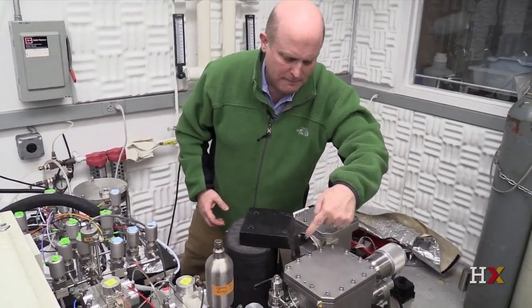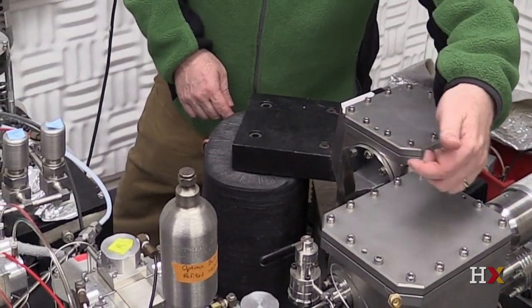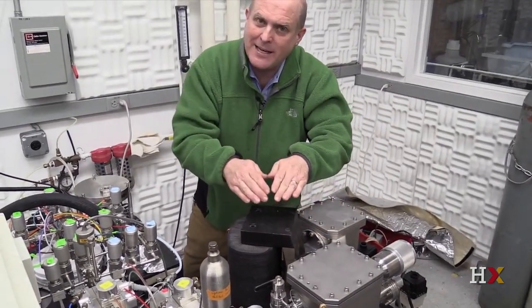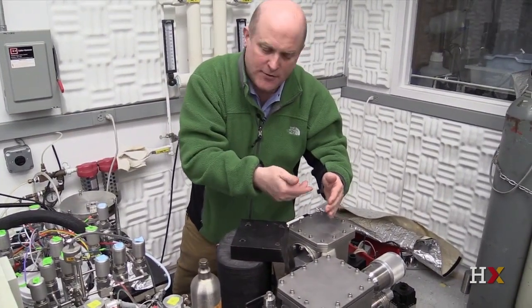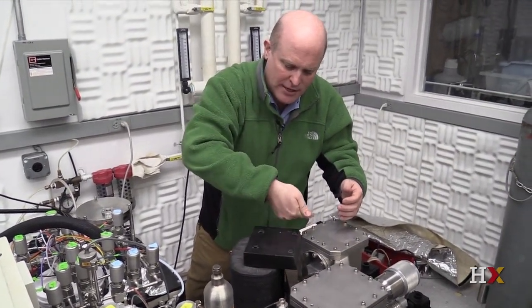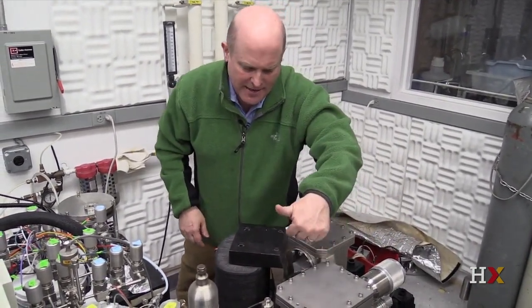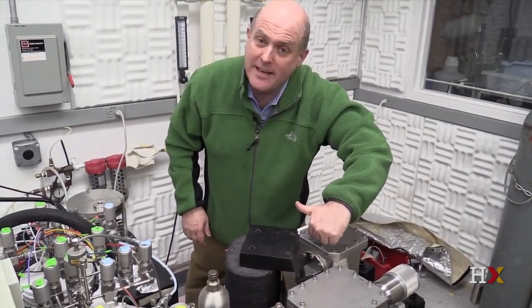which you can see right here. This is the flight tube that's flat here. It's all under very high vacuum. The CO2 ions are all mixed together, all the different masses of CO2. But when they encounter this electromagnet, they actually start to bend. And the amount they bend depends on their mass. So the heavier ones that have the heavier isotopes bend less and take an outside path around this curve, whereas the lighter ones that just have carbon-12 and oxygen-16, they bend the most and take the inside route.